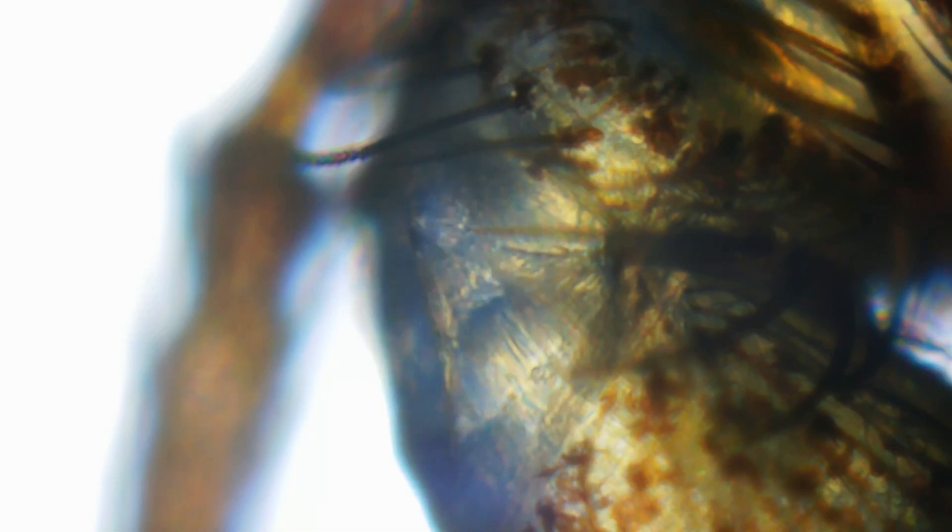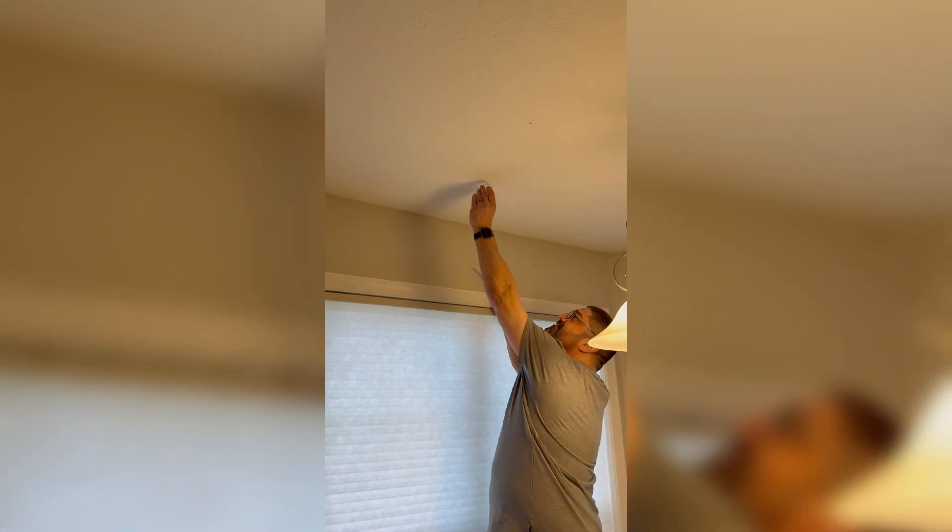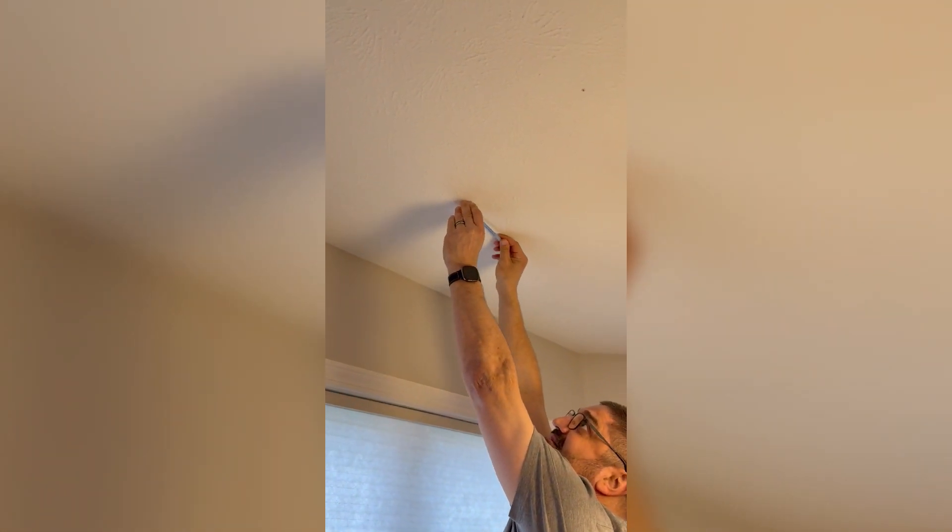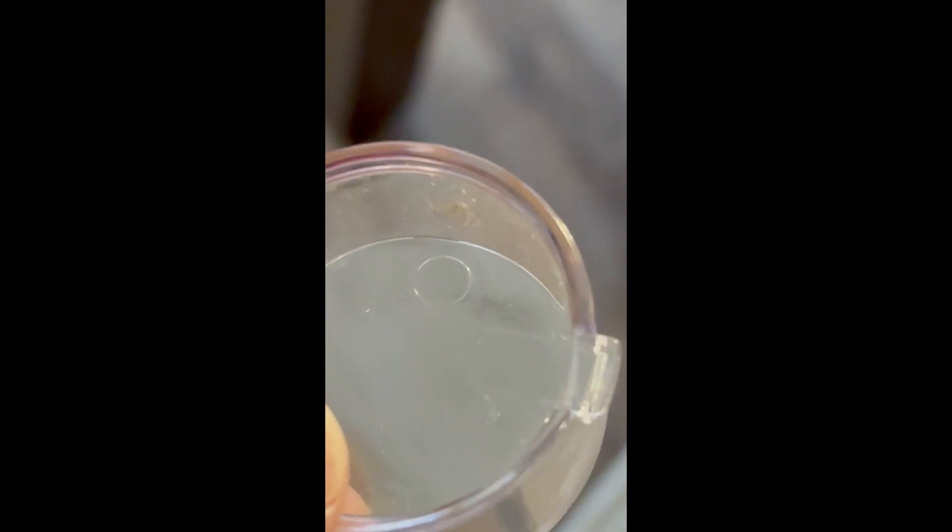Aurora's Little Lab. Welcome back to Aurora's Little Lab. Today we've got something really special. I caught a little spider and we're going to look at it under the microscope.